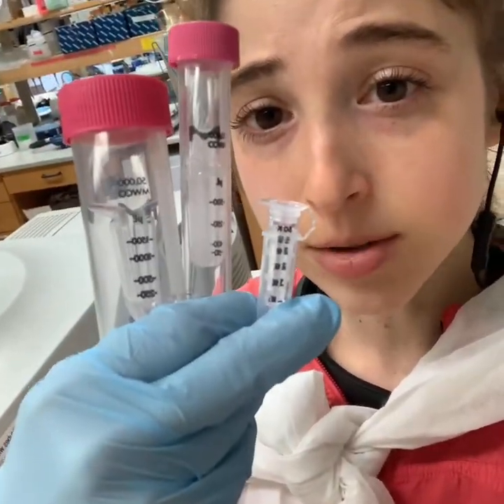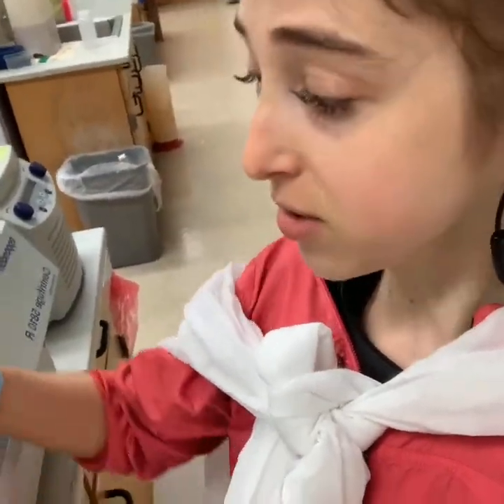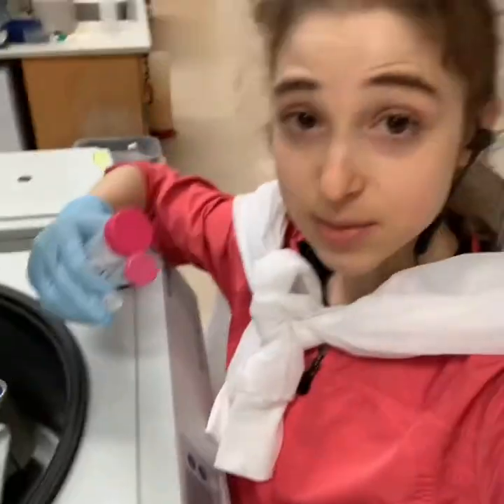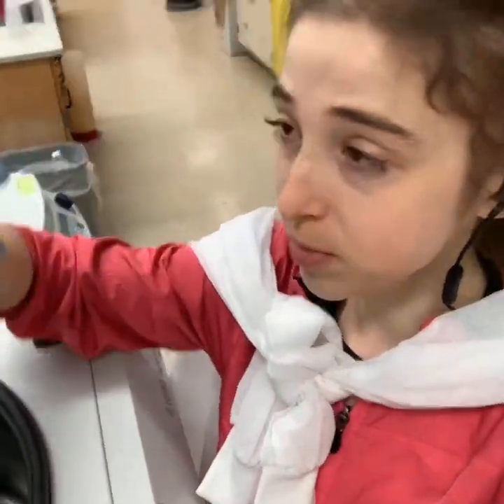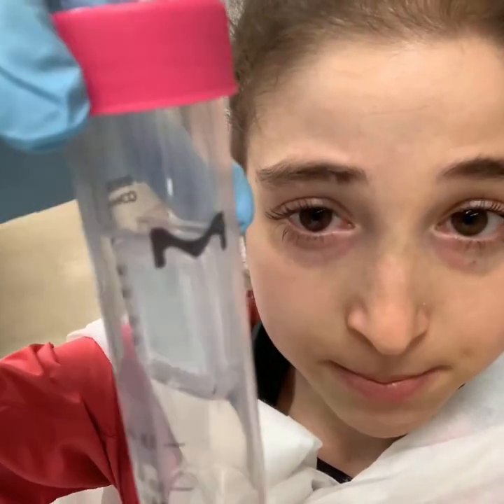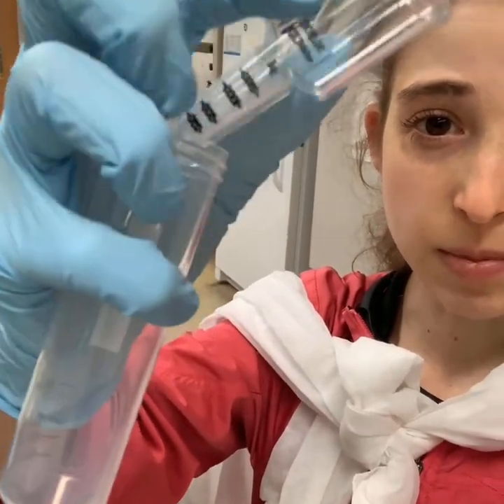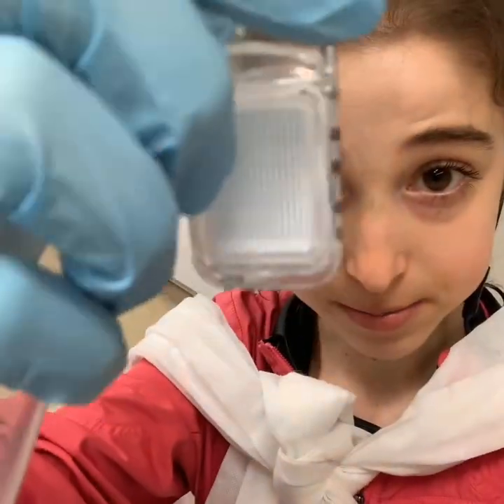They come in different volumes and you stick your sample in there, and then it uses a centrifuge — this thing that spins really fast — so you put the tube in here and it'll spin it really fast. What it does is these have a membrane in them. The sample goes in this little cup-like part and this cup part has a membrane, and they have different sized membranes with different sized holes.